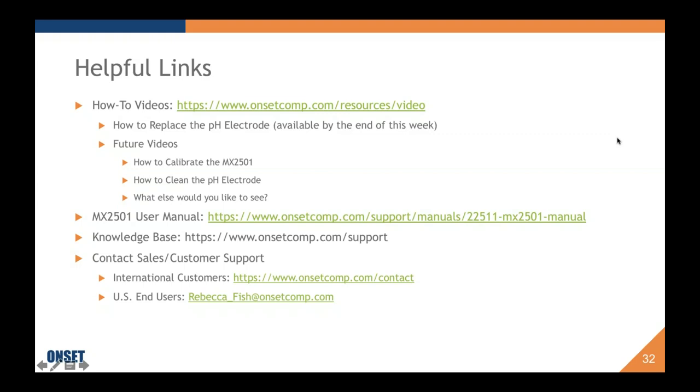Thank you very much. Okay, I'm going to go to Nick's question. He's not here anymore, but I'm just going to answer it. Assuming I know that the water will have a conductance far below 100 microsiemens per centimeter, is there any way to turn off the water detect? Yes. So we did answer that. I'm sorry we didn't catch you before you left, Nick. Hopefully you'll download the presentation.